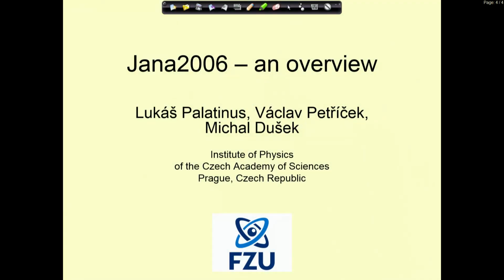You see the authors of the presentation are listed as myself, Václav Petříček, and Michal Dušek. In fact, if the list of authors should be ordered by order of importance in contributing to the program, then it should be Václav Petříček, Michal Dušek, and myself, because the main developer of the program is Dr. Petříček, who has worked on the program now for more than 30 years.